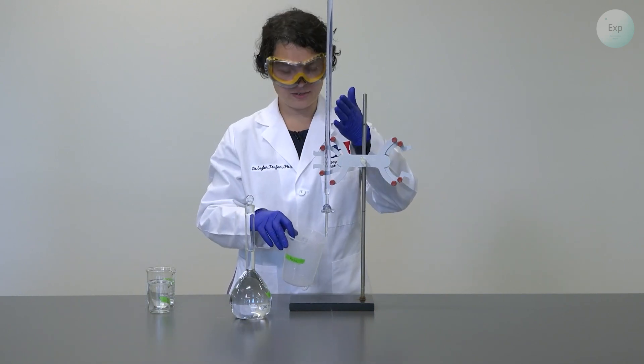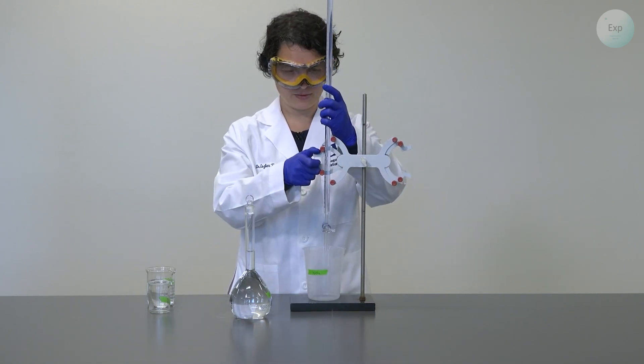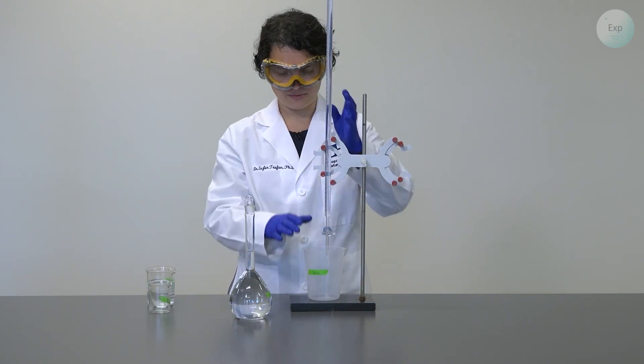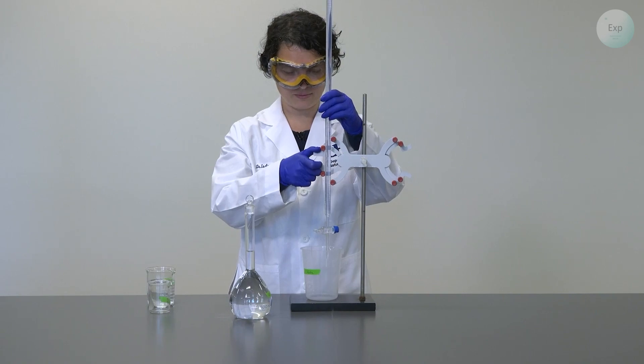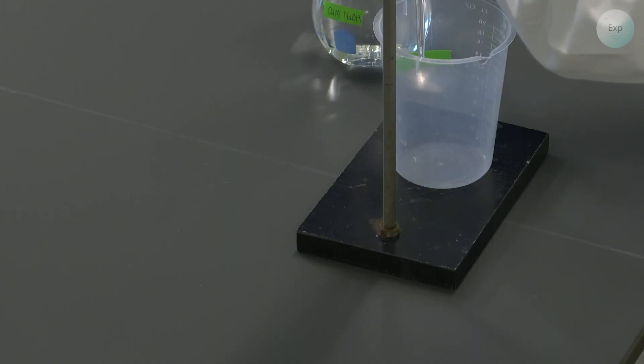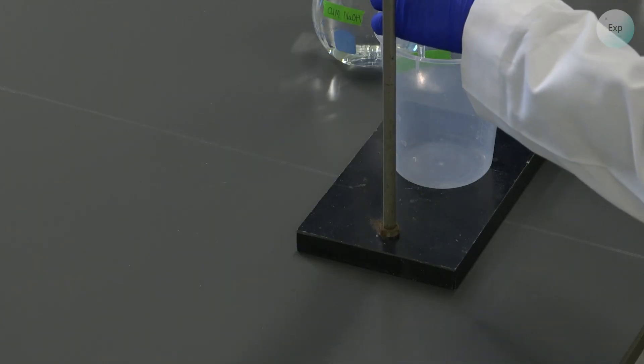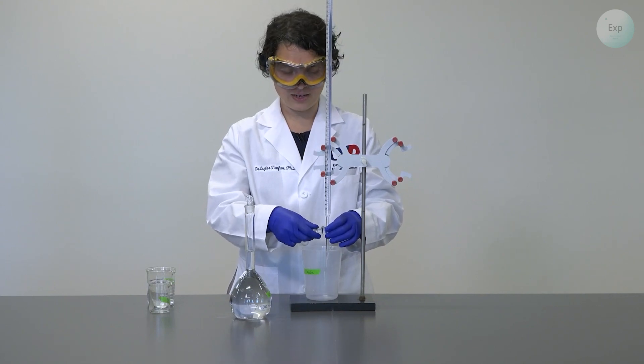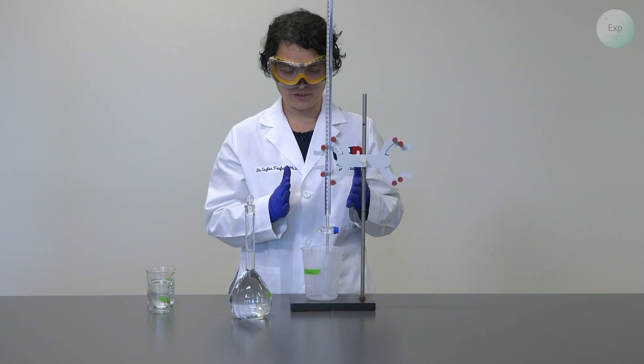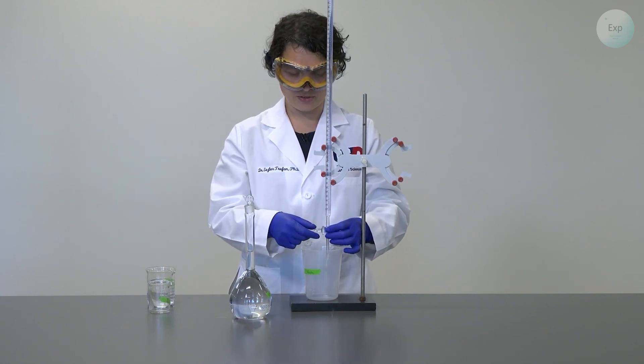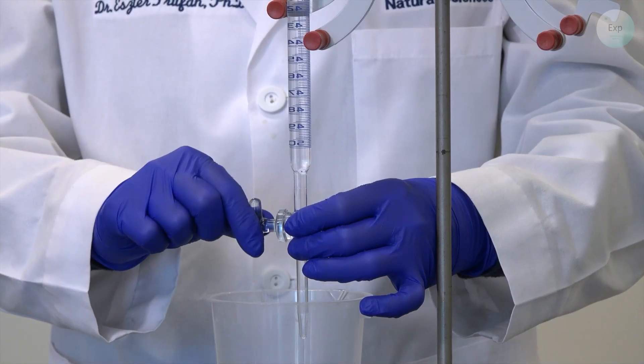Then because whatever it is that we are washing out with the water is going to be waste, we bring our waste container right below our burette, and then we learn how to operate the stopcock. The first thing that we need to learn is how to completely open it and release our water in a straight stream. We hold the case of the stopcock and we open it up completely.